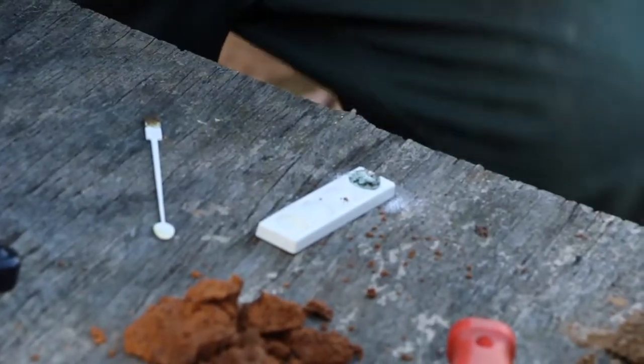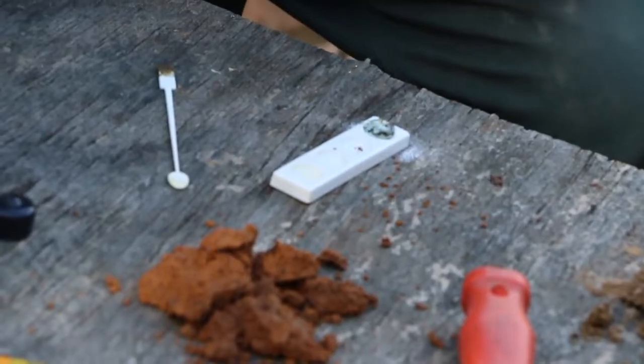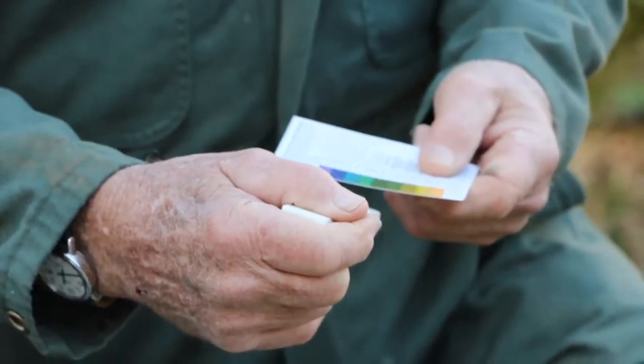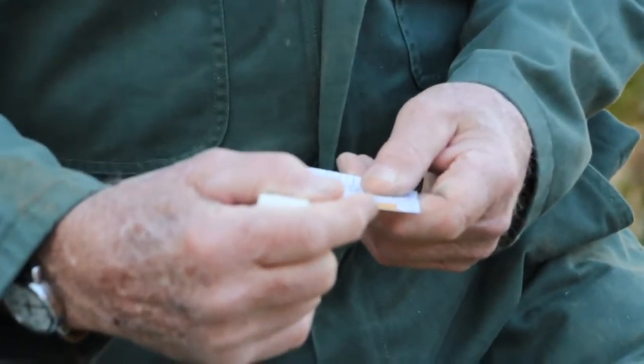Allow it to stand two minutes out of the sunlight or in the shade to allow for the reaction to take place. Then it's a matter of comparing the color that develops on the sheen on your sample to the color chart.